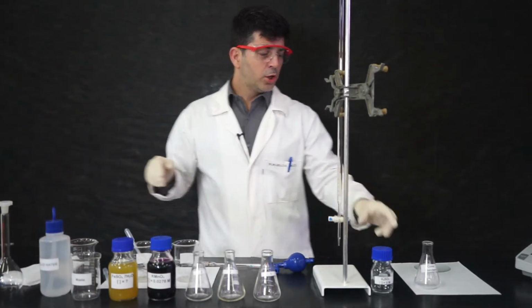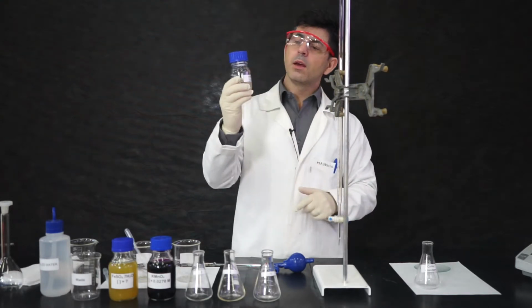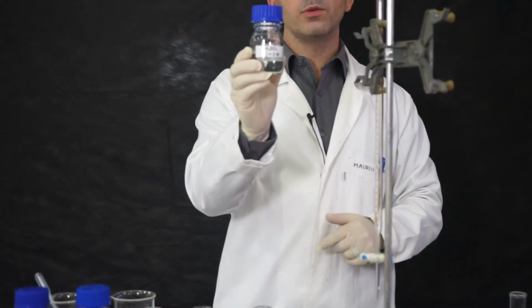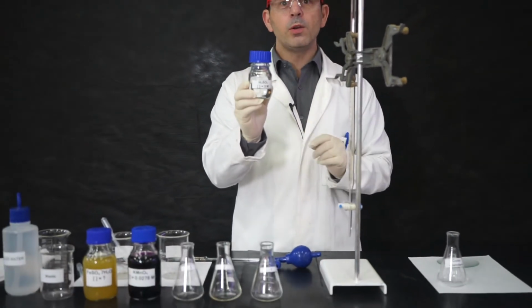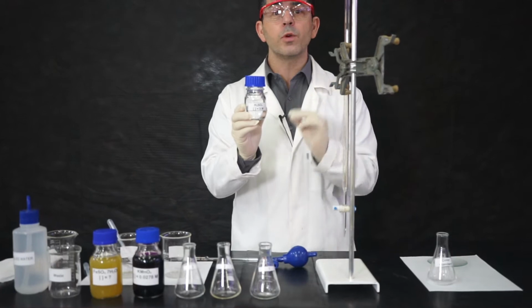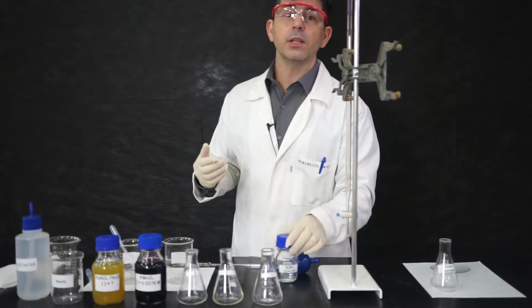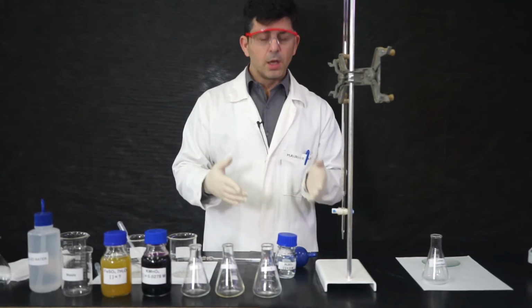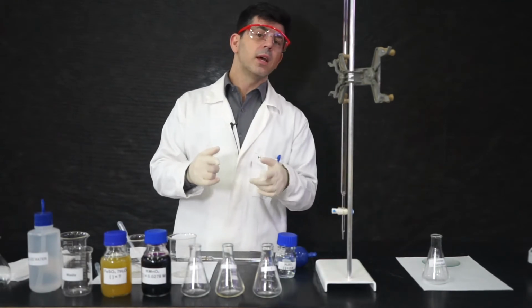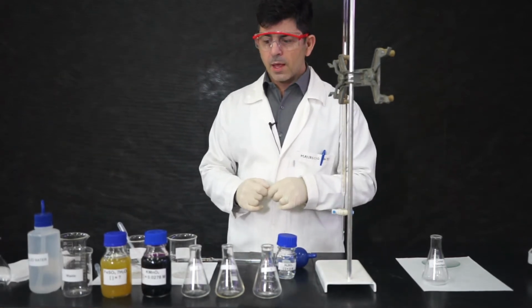and you will need sulfuric acid. Here, a 3 molar solution of sulfuric acid. This sulfuric acid will guarantee you have an acidic solution for the titration. You will have to find on the internet the chemical reaction we're going to perform here today, and you will see when you find it that you need sulfuric acid to make sure the solution is acidic.